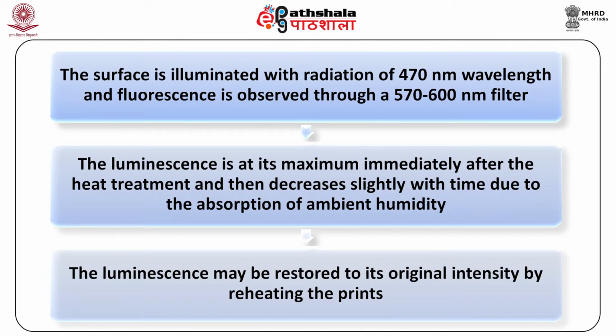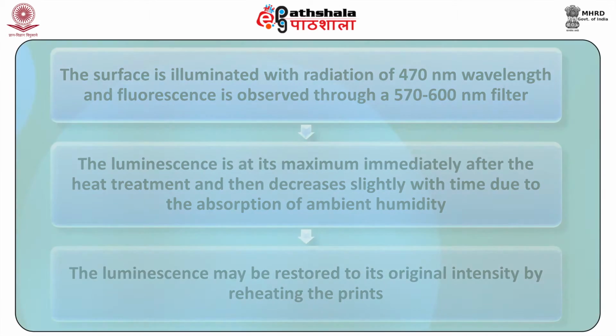The surface is illuminated with radiation of 470 nanometer wavelength, and fluorescence is observed through a 570 to 600 nanometer filter. The luminescence is at its maximum immediately after the heat treatment and then decreases slightly with time due to the absorption of ambient humidity. The luminescence may be restored to its original intensity by reheating the prints.